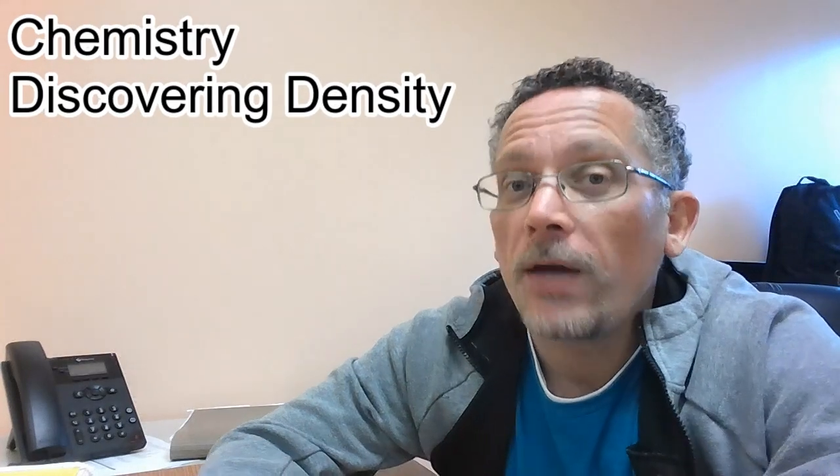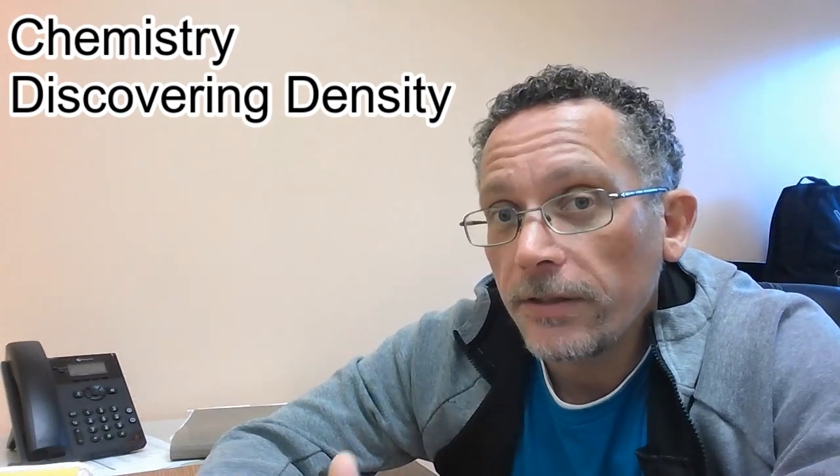So today we are going to do a lab activity called Discovering Density. We're going to take a look at a couple of different materials, and we're going to learn how to find the density of those materials. And every different material has its own unique density, right?